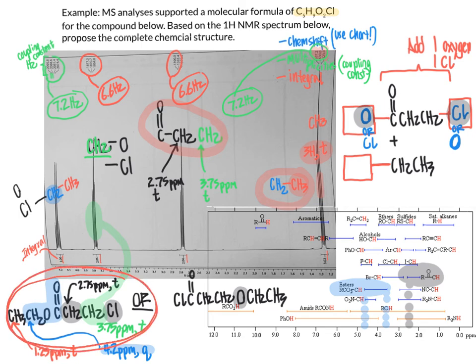So what I hope I've illustrated here is that when you are determining the structures of organic molecules, you need to focus holistically on the chemical shift using the chart as your reference guide, and the multiplicities to make sure that they match up with the number of vicinal hydrogens or the expected splitting pattern if it's a complex splitting pattern, including the coupling constant values if those are available to you as another piece of evidence for which hydrogens are vicinal to one another. And then also be sure to take advantage of the integral values that are listed for you here to determine how many hydrogens compose each signal so that you know whether you're dealing with a CH group, a CH2, or a CH3 group.